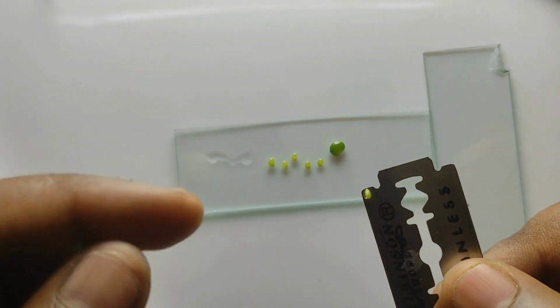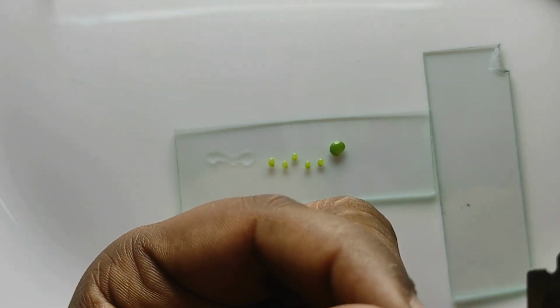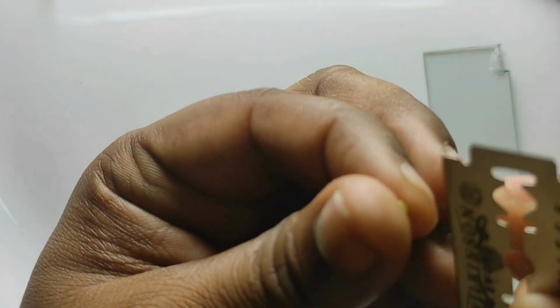Take a new razor blade and keep the seed in between index finger and thumb where the micropylar end is facing your palm. Now cut the seed into 2 equal halves, like we did in endosperm mounting of cucumber.